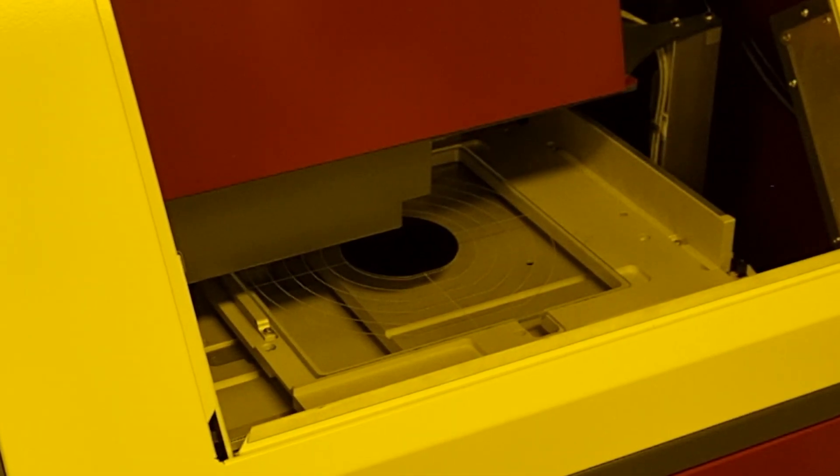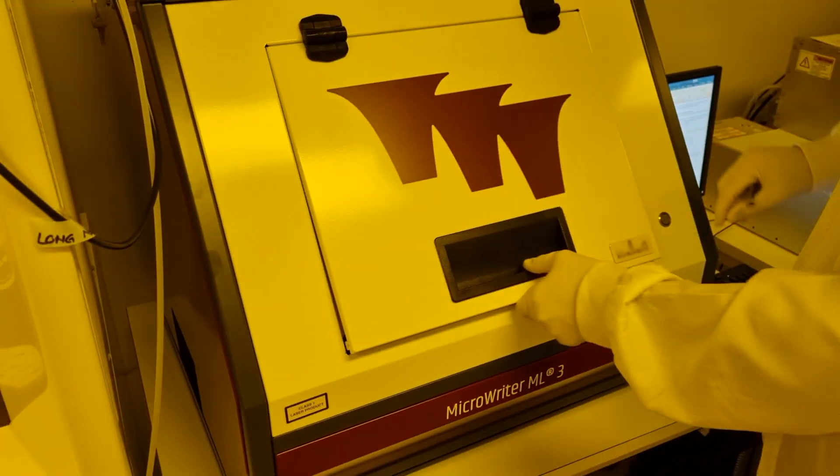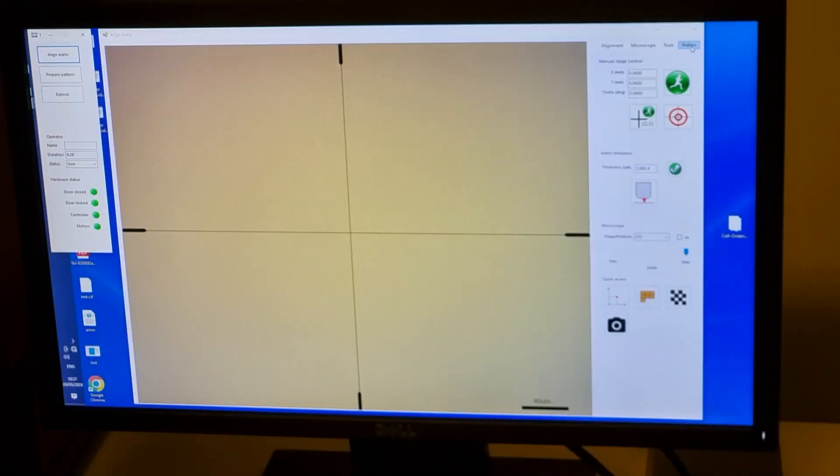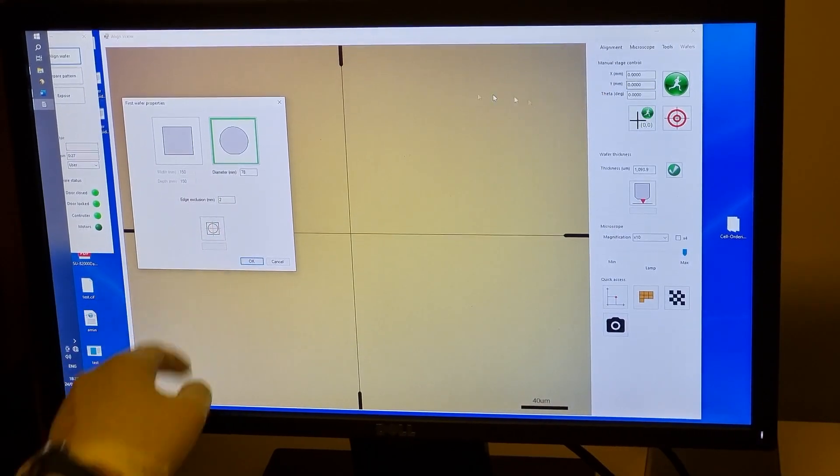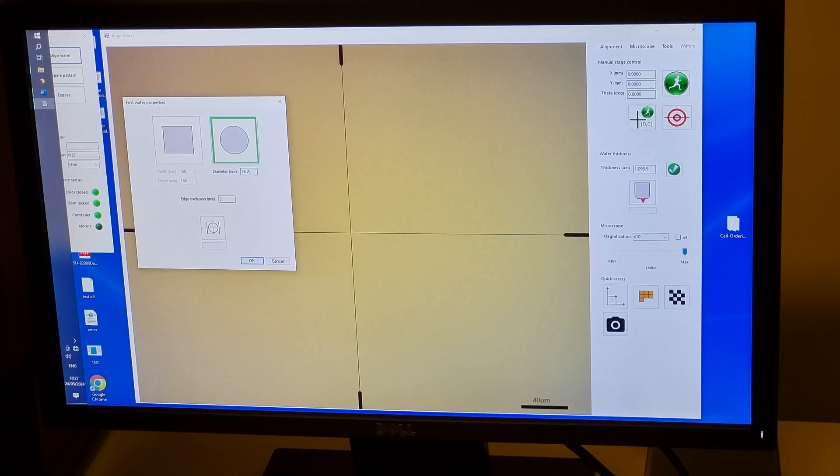Load the wafer in the center of the Durham MagnetoOptics ML3, then close and lock the lid. In the DMO software, the first window is Align Wafer. Under the Wafers tab in the top right, we define the substrate. Our substrate is a 76.2 mm or 3 inch circular wafer.